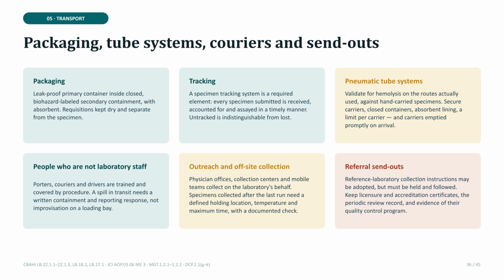For anatomic pathology, every container and slide must be labeled individually at the moment of collection. You must document the anatomic site and laterality on both the label and the requisition to ensure absolute clarity throughout the diagnostic journey from the surgery to the archive.